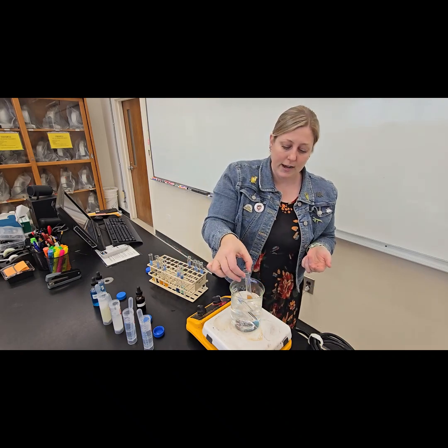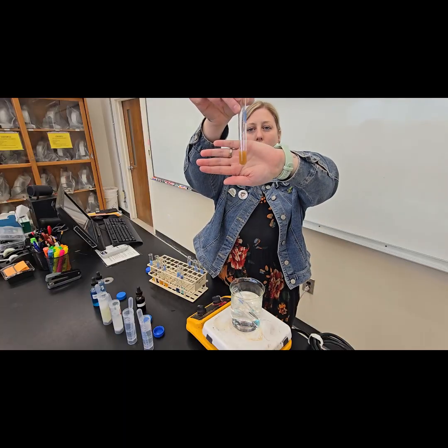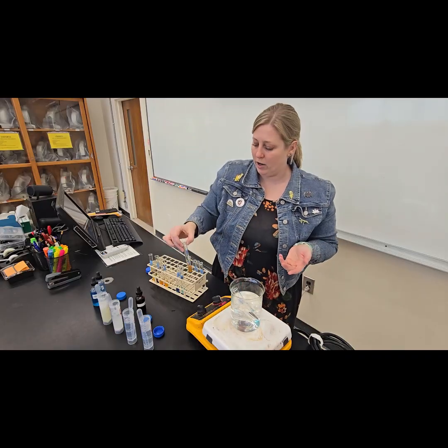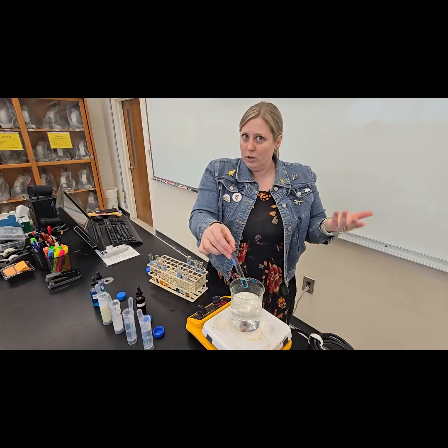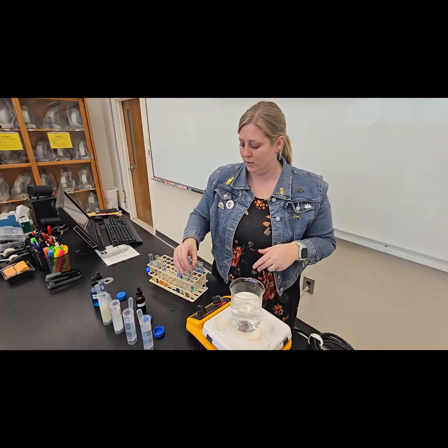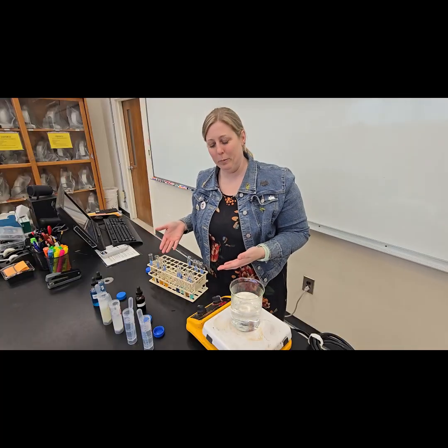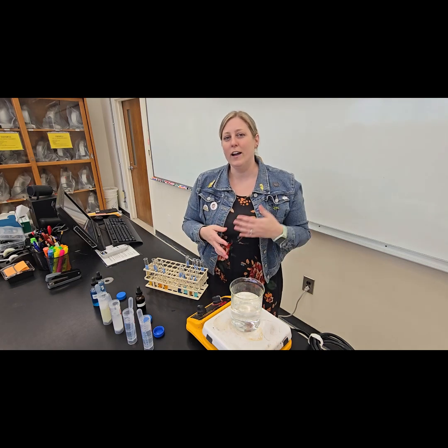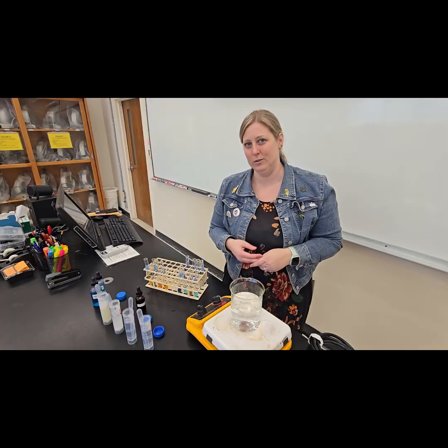In my glucose, I am going to expect a color change. And in this case, we have this bright orange color. So the more orange it gets, the stronger the sugars that are gonna be in it. And so my glucose should have a positive response for a glucose test. And then water, once again, we're having a negative response on that distilled water. So that just means that all of our positive and negative controls happened appropriately. And now you should be prepared to go to the next part and try and figure out what we might see in some of these food items, including our unknown solution.